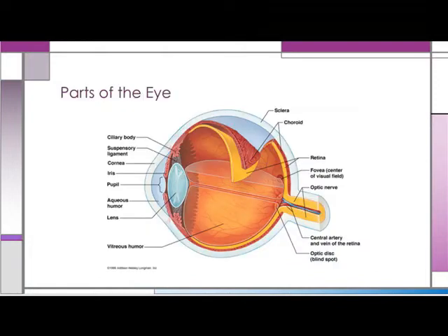Now that we have defined the parts of the eye and their function, we will begin our dissection. But first, a little bit about safety. During this dissection, you should be very careful with the tools as they are sharp. Never walk around with a tool in your hand. You should also wear gloves and safety glasses, a lab coat if available, and have fun.